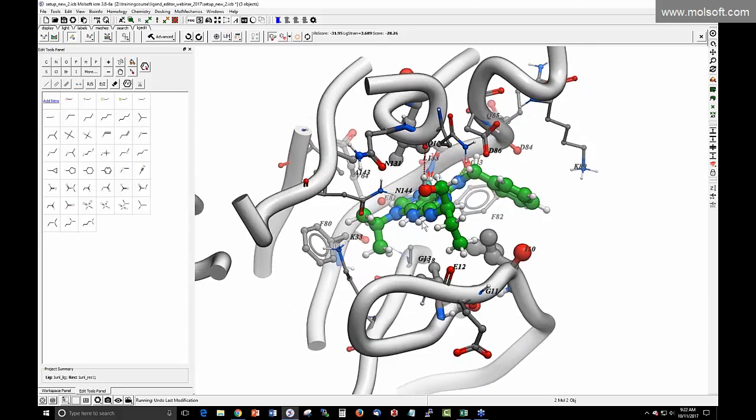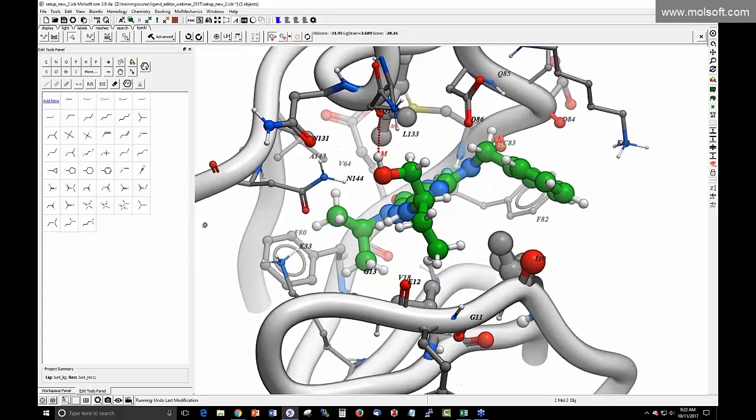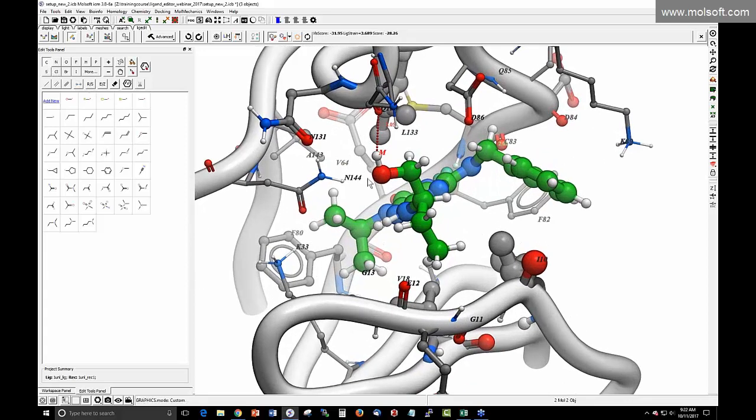For example, to change an atom, we can click on the atom here and just click here, and that would change this from a carbon to an oxygen. You can evaluate the score again. The score actually went higher, so it's probably not a very good modification. The lower the VLS score, the better, and you can undo the change and go back to your original molecule with that hydrogen bond.